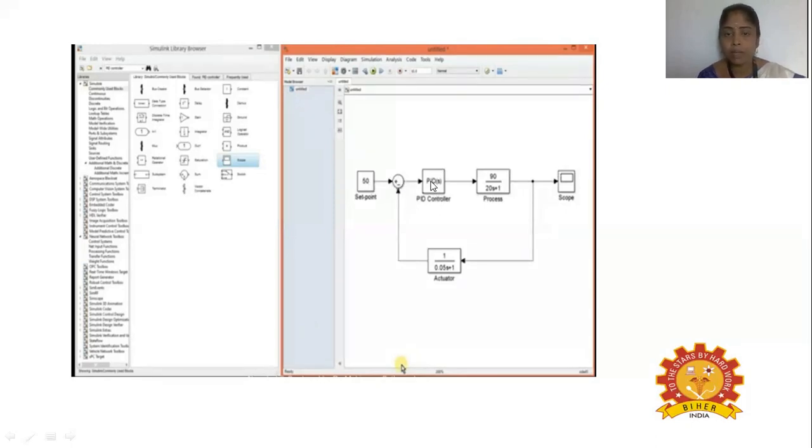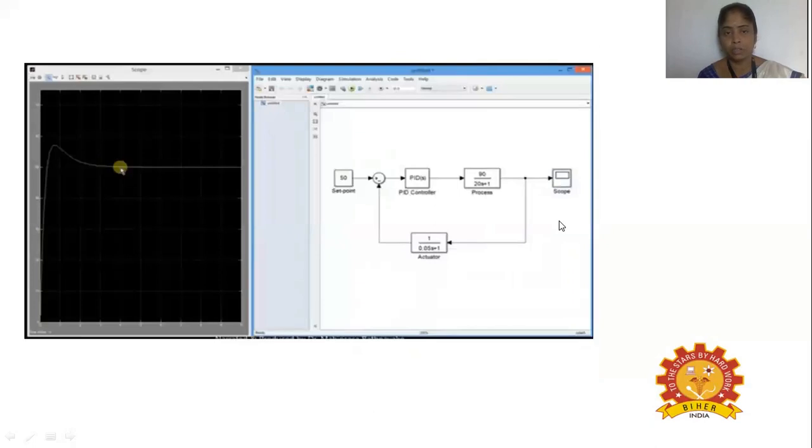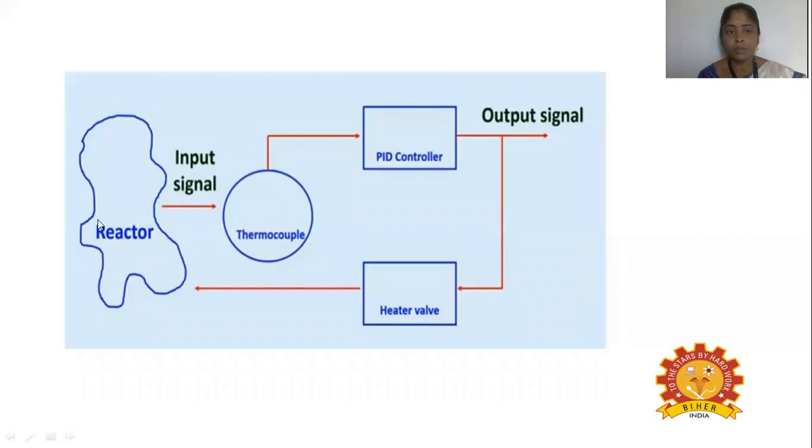Here this can be controlled with the help of a controller that has been incorporated in any bioreactor, a proportional integral derivative controller. That will sense the process. What has to be monitored, formed or maintained as an accurate value, that will be the scope. That can be monitored in the case of your automatic controller using MATLAB software in the control room.